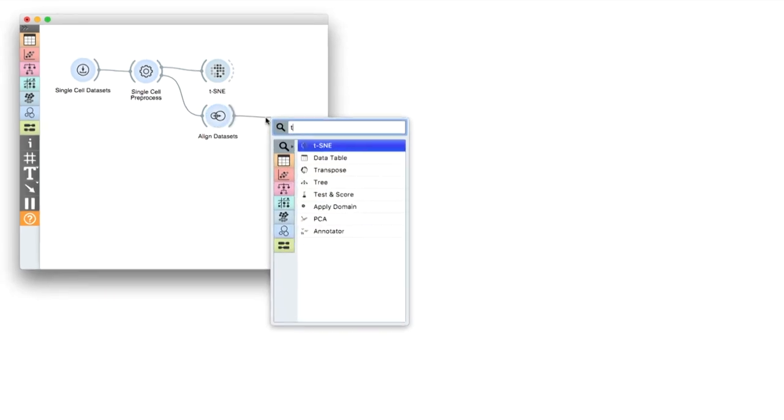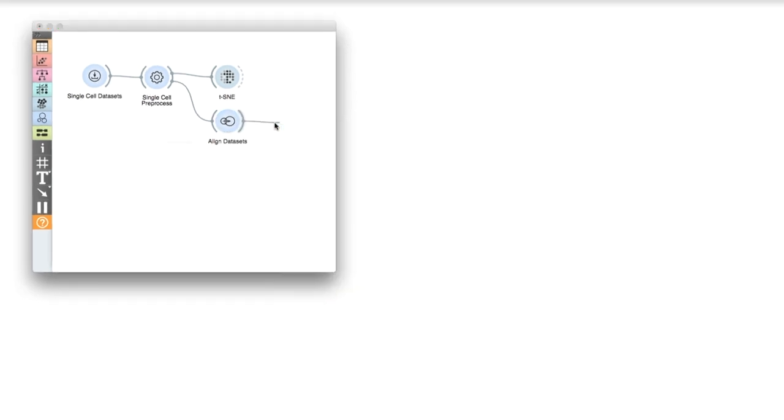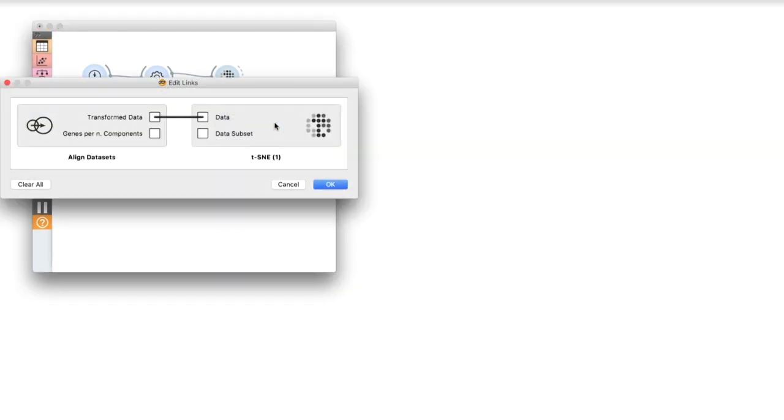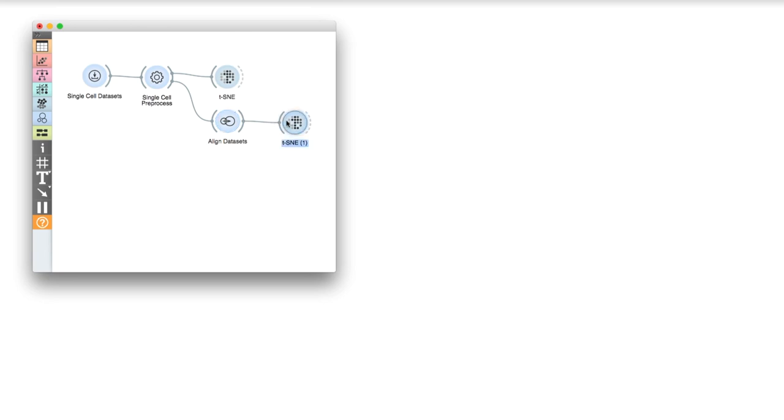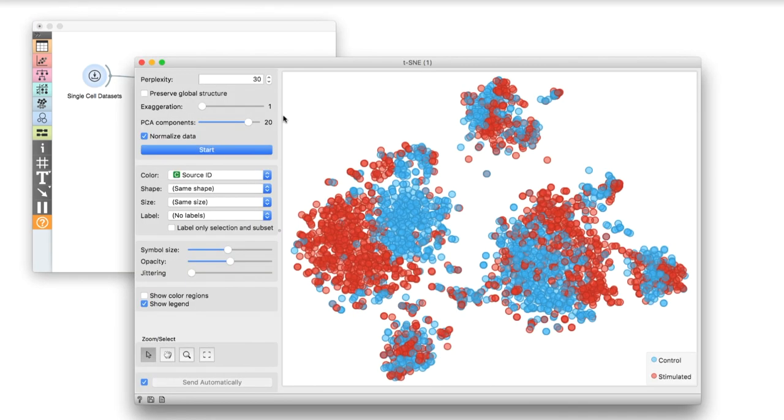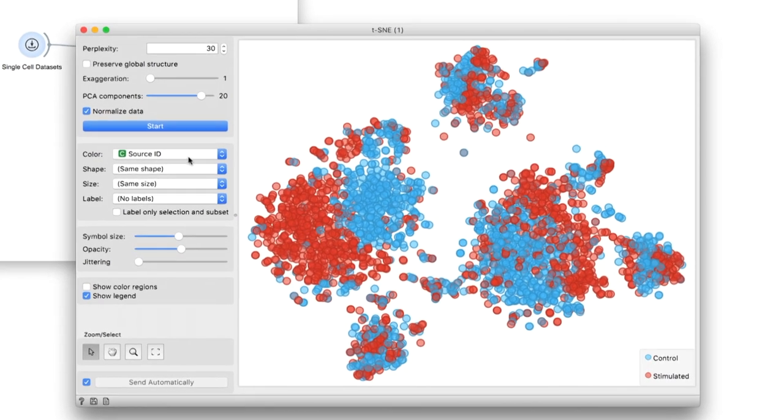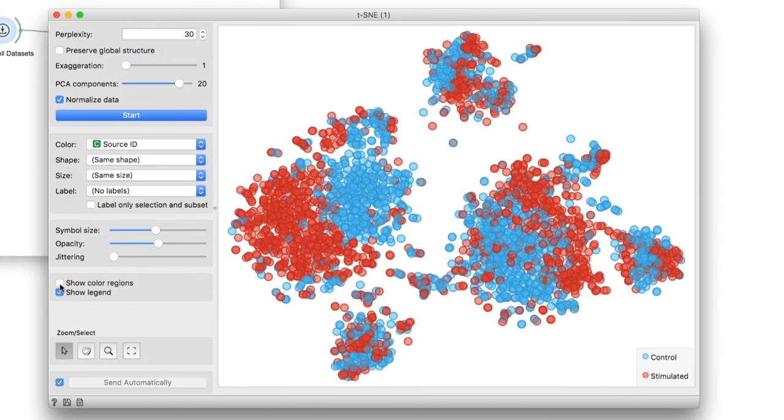After discarding experiment-specific variation, the clusters remain, but are now composed of mixtures from the two experiments. Neat!